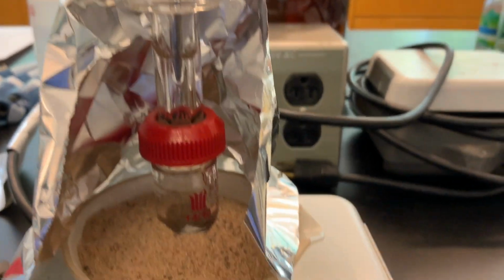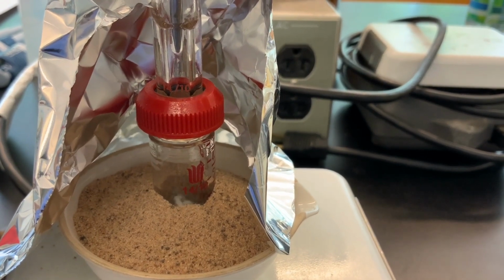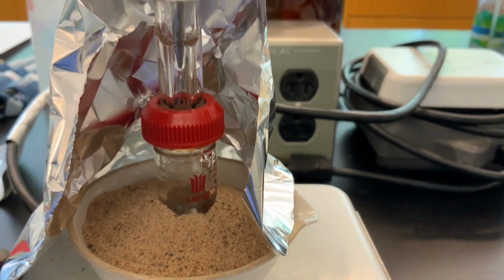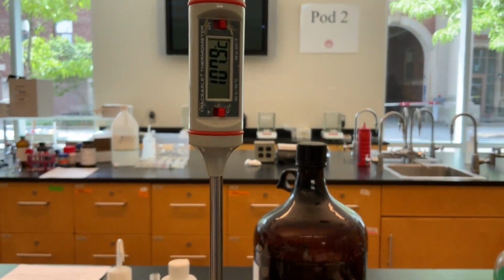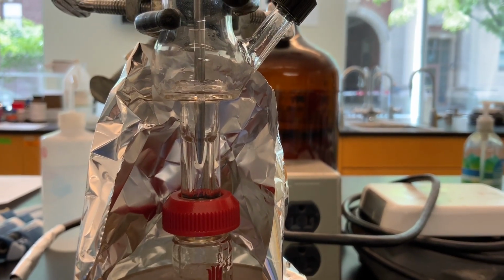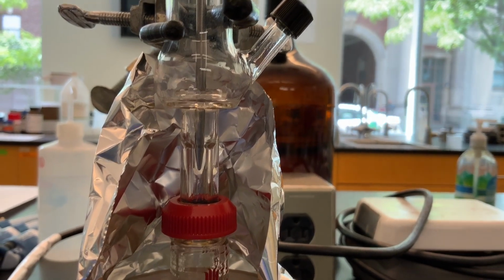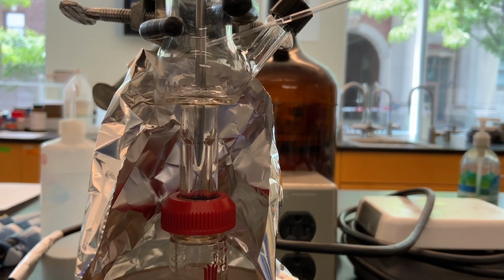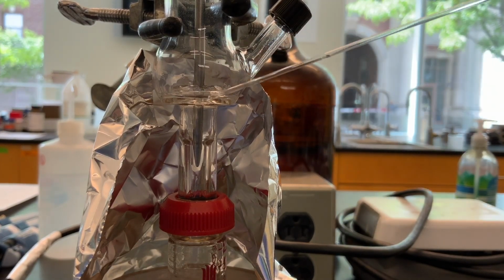And so we're just going to wait basically until all the toluene is almost gone, and then we'll turn off the heat because we don't want to just heat the vessel without any liquid down there. So 107.8 is still going. And so now you see that very clearly the toluene is condensing now from this side of the wall as well. It's much higher boiling than hexane.